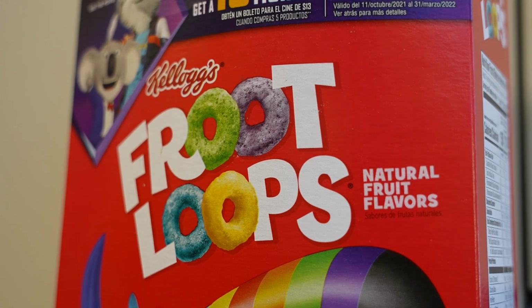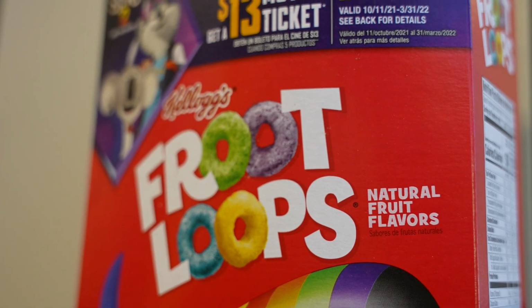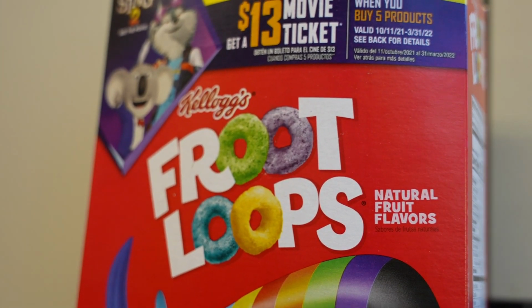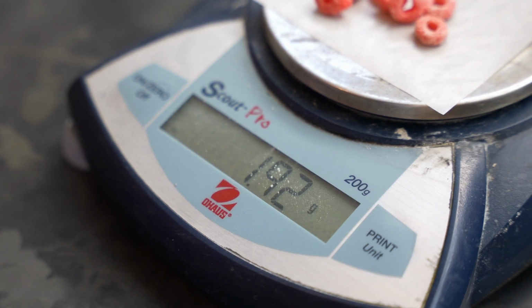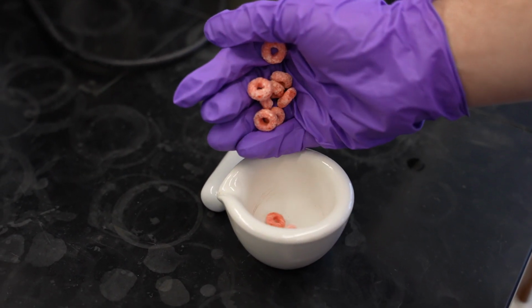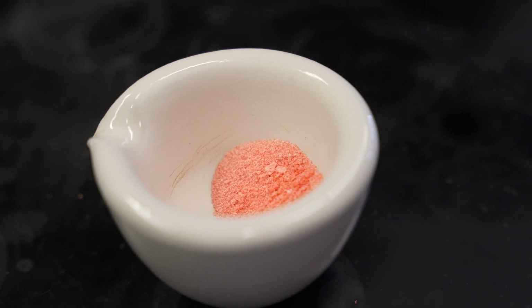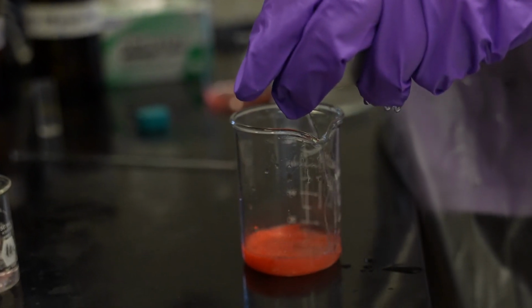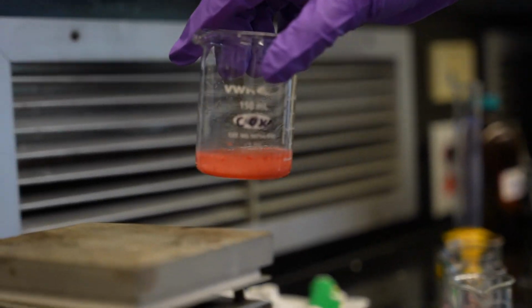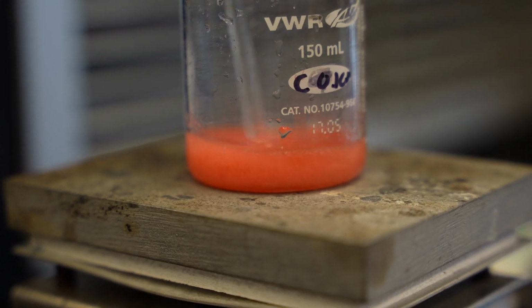In Part 2, you'll be making your own mixture of dye using Fruit Loops of the same color as Part 1, and then repeating the same steps as before. You'll grab 10 rings of Fruit Loops of the exact same color, measure and record the mass, and then use a mortar and pestle to grind it up into a powder to pour into about 25 milliliters of DI water. Heat up the mixture until it starts to boil using a hot plate, making sure to stir up the mixture to speed up the reaction.